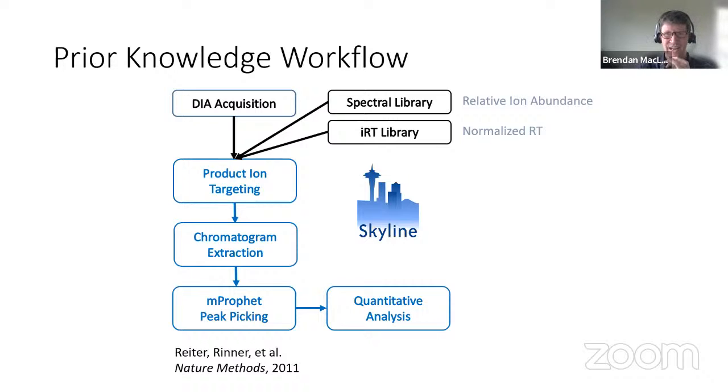I think DDA data is clearly highly useful and highly reliable. There are some cases where you'll go, oh, that doesn't quite match up, and I think I know why. If you are doing DDA acquisition, you want to make sure that the fragmentation is the same. So you're going to have more cases where things don't match up if you used ion trap CID fragmentation in a Thermo instrument versus HCD. So there are some things to watch out for. But we use tons of DDA data, and even PROSIT prediction libraries are based on DDA data. So DDA data has been highly proven to work well with DIA data.